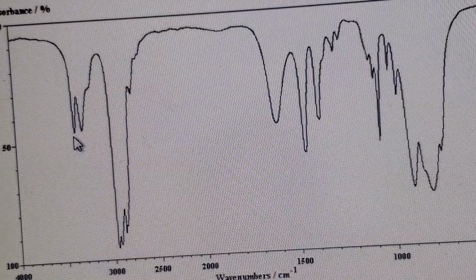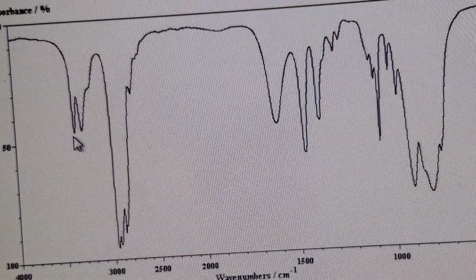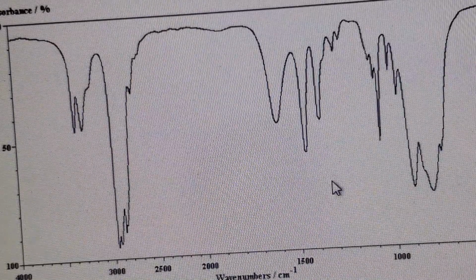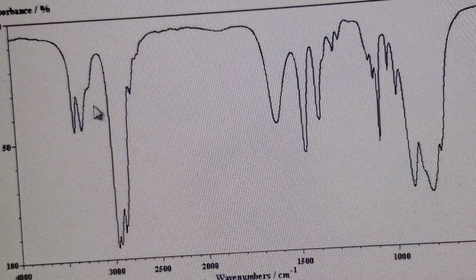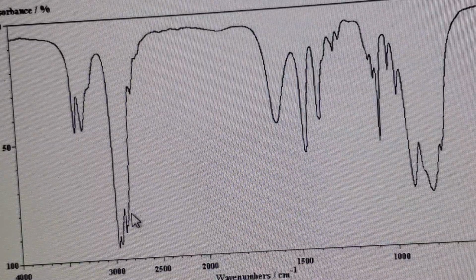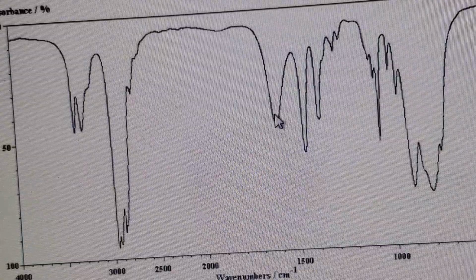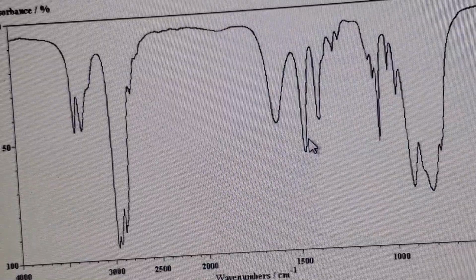Most likely that's giving a smaller force constant than carbon-oxygen, so you are expecting them to come around here. And it's hard to assign for now. But anyway, then you look at the CHs, anything below 3000, that's what you have. So there's no alkene-alkyne situation, obviously no alkyne triple bond. And to be alkene, this is too broad, and that as well is too broad.